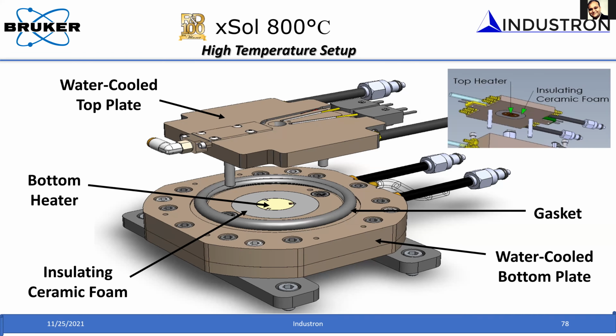Okay. And the third thing is, if you're having an O-ring like this, you can create a micro chamber, and you can keep an atmosphere within the chamber, whatever atmosphere you want. So for example, when you try to do this on a material like metals, which are very sensitive to oxygen, when you try to heat up, it will oxidize the sample surface. By passing in inert gas, you can avoid that. So by creating a small chamber and passing an inert gas, you can control the oxidation of these metals when you try to heat them. So it's a unique micro heating chamber design.